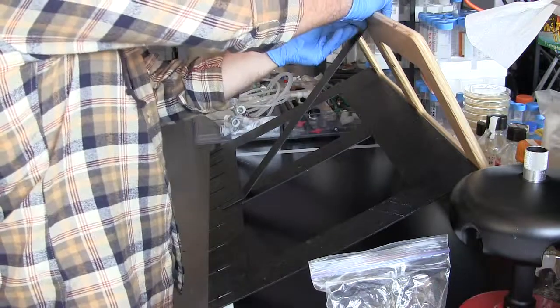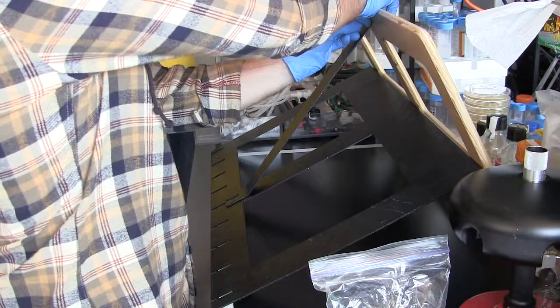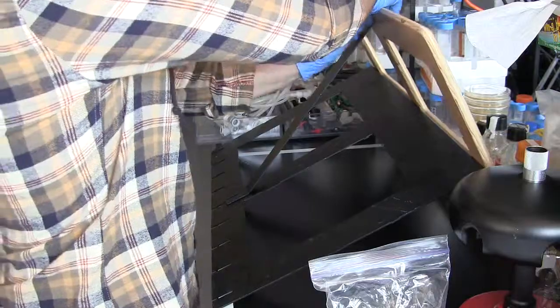Oh. And then you tighten up the nut onto the bolt to secure the stand, the brace to the back. Okay, so that's nice and tight.